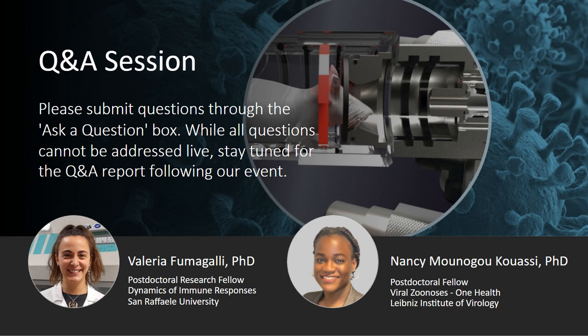We can do pretty much anything, because we can keep the hamster for 3 years, for example, in the lab. Then we can take all these measurements prior to infection, 20 days after infection, but also 1 year or 2 years or 3 years after infection. It's a great model. In my opinion, it's really, really great. And I mean, the people out there also realize the hamster is the gold standard, and a lot of people are working now on all these different high-risk groups in hamsters. Yeah, my answer is definitely yes.